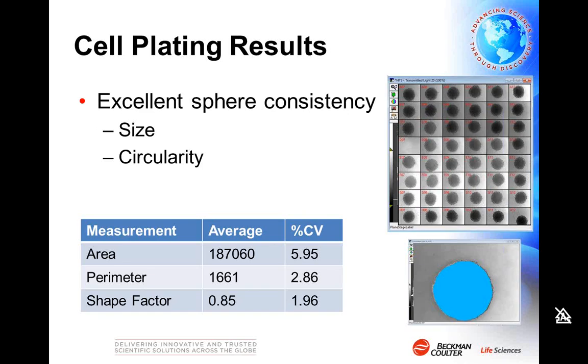When it comes to consistency, we wanted to, again, make sure that our spheres were consistent across the plate. So we actually used our imager to look at size and circularity.